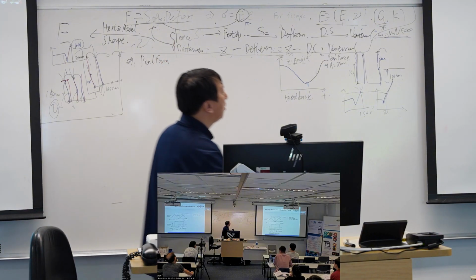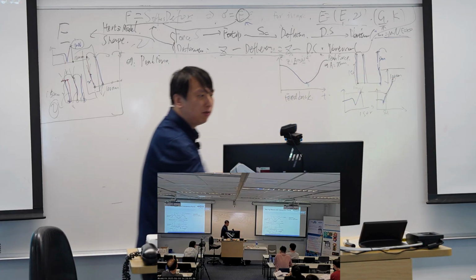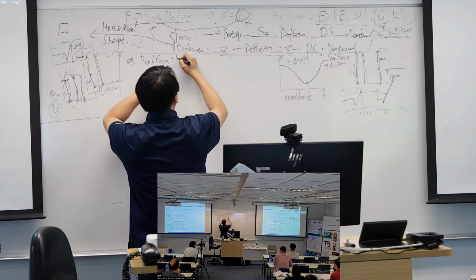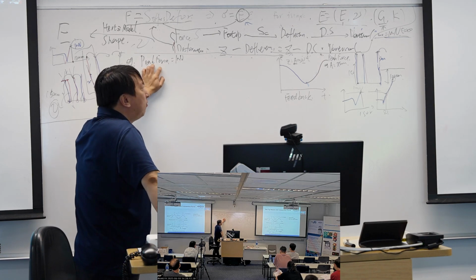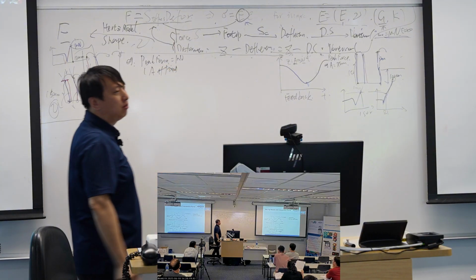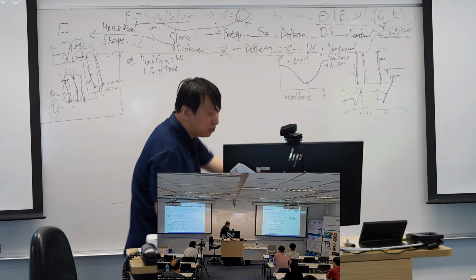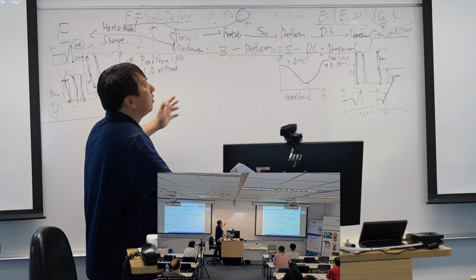The peak force means the maximum force on each force curve. The peak force I set, for example, is 1 nanonewton. To reach this peak force, I have to travel a fixed amplitude. For example, in this case, the amplitude is 75, so it goes down or goes up 150 for each cycle.